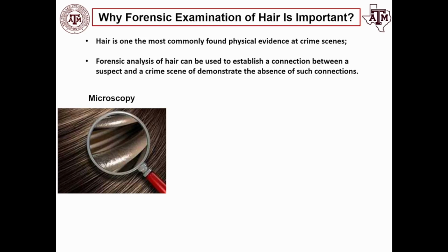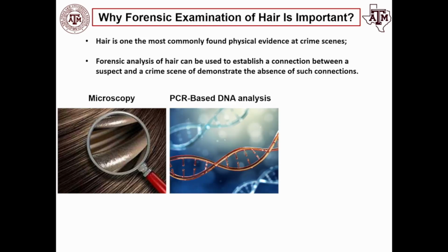The problem with microscopy is it not only requires a lot of training for the forensic expert to perform it, but also it's very subjective, and as a result, mistakes are made by forensic experts pretty frequently, and there was a study on this published in an FBI report. As a result of the subjective nature of microscopy, other techniques should be deployed to advance the forensic analysis of hair. One of these techniques is polymerase chain reaction, as well as its analog, quantitative PCR or qPCR.